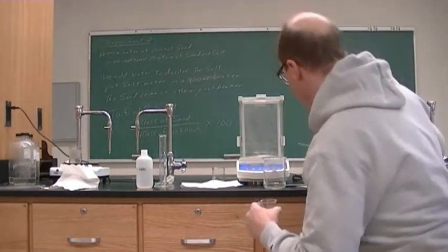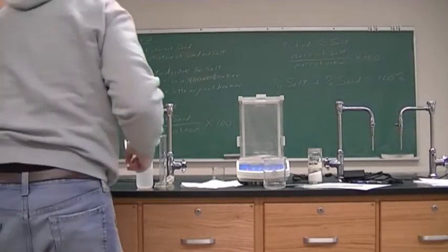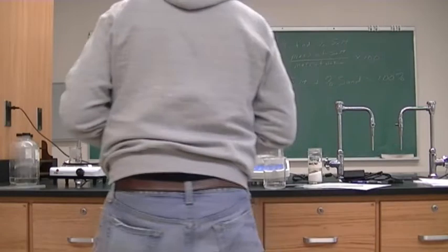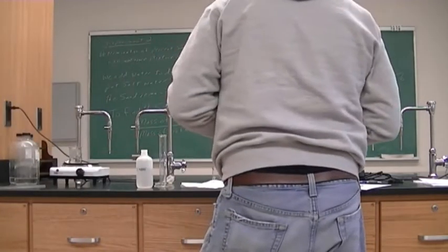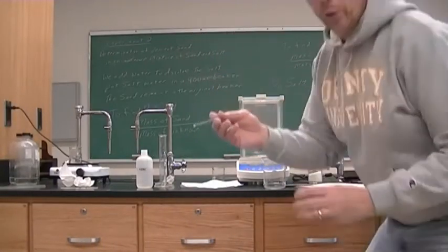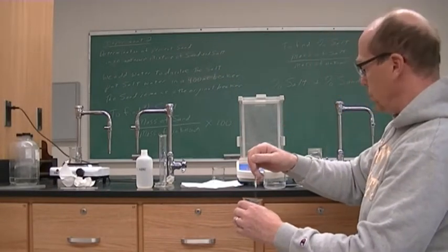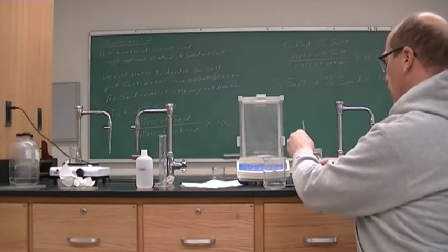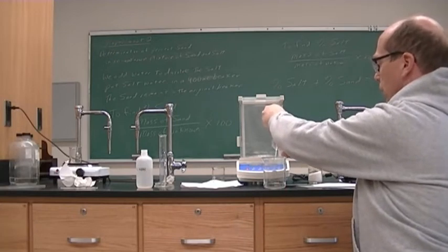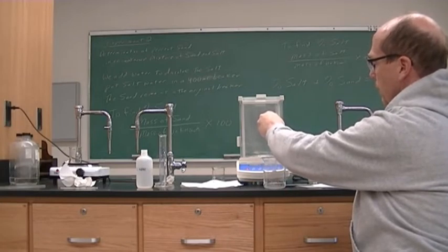Number two is ready for decanting. We can use the same stirring rod because all of the salt is going to dissolve and no sand is going to stick to our stirring rod. So again we're going to decant — which means pour out the salt water, leave behind the sand.